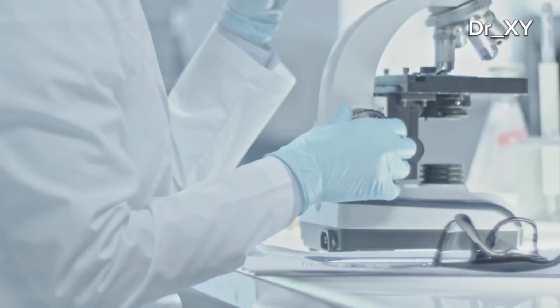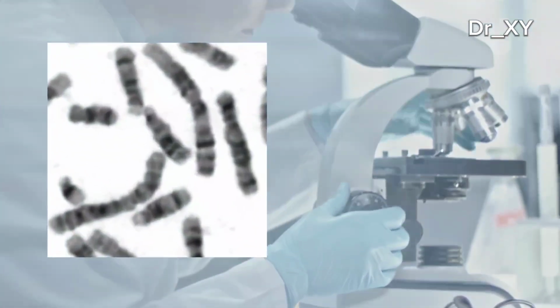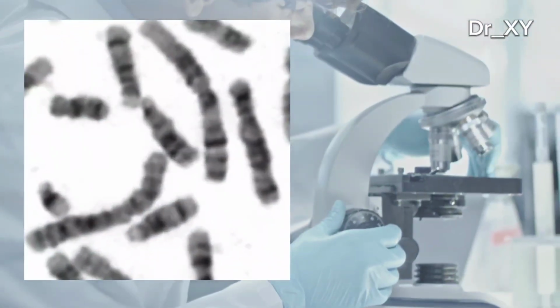So now these are the sample types: live samples that can divide happily in tissue culture, so blood or skin. Then once chromosomes are obtained, the cells are dropped onto a glass slide and stained with a special stain. And these stains will give the chromosome banding patterns depending on the underlying sequence of the chromosomes.